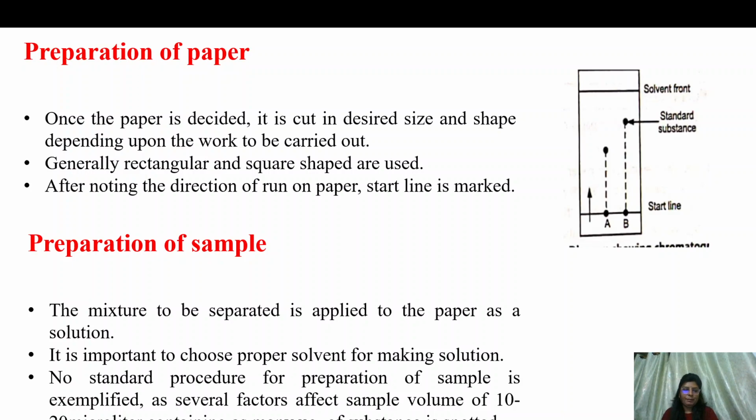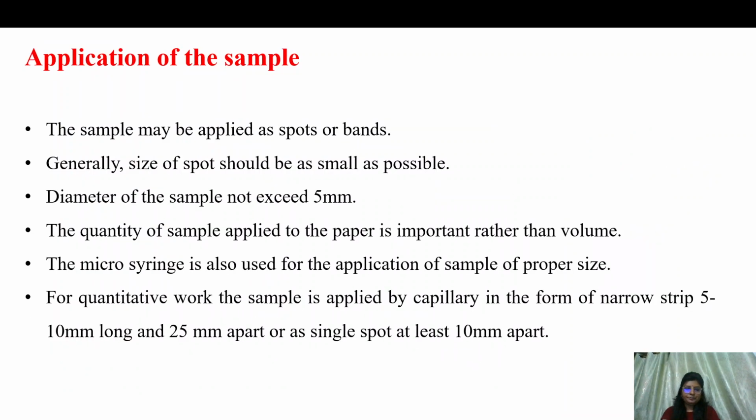Then how you will prepare the sample. The mixture to be separated is applied to the paper as a solution. There is no particular procedure given, so you can prepare that sample, and 10 to 20 microliters you can apply on that filter paper.